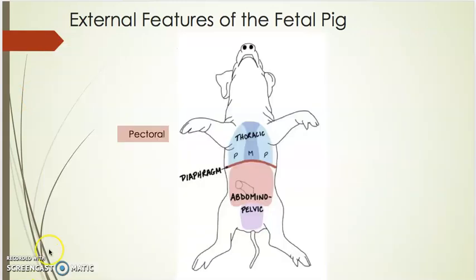And I also brought this in because there's not much in the information that you have in the other folders in regard to the pectoral region. You will need that for your report sheet. The pectoral region is your pecs, your pec muscles, your chest muscles. They are in this area, which is labeled P, but the P is for pleural, the pleural cavity. The pleural cavity is where the lungs are. But if you want to use it as a mnemonic, that's fine with me.